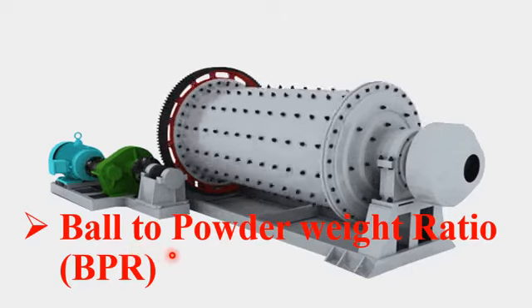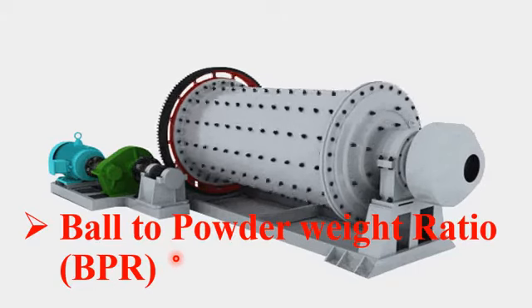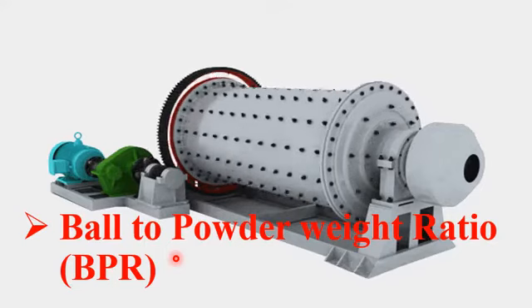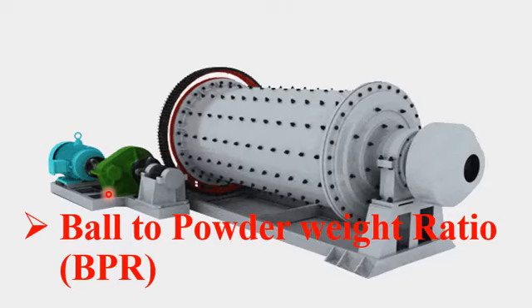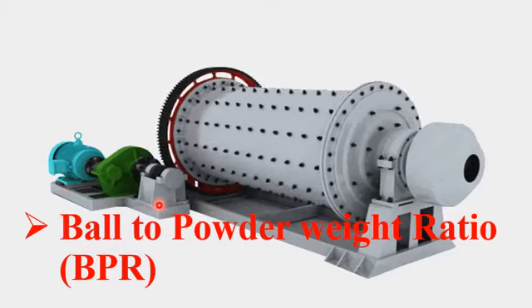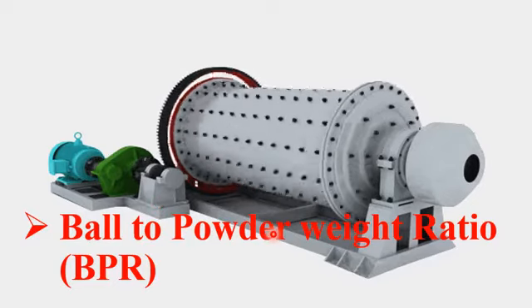So the ball to powder ratio varies from 10 to 1 to 15 and even 20 to 1. It depends on the size of the ball, the nature and size of the powder, and also the requirement of the end product.